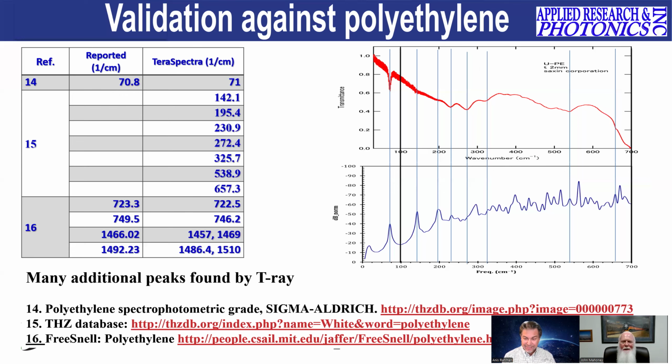I just want to point out that Teraspectra T-ray time domain spectroscopy was able to detect molecules such as endohedral fullerene that no other known method was able to detect. Well, to detect the way T-ray could, yes, absolutely. Okay, all right, very good.